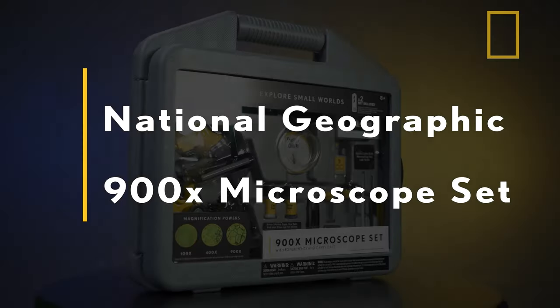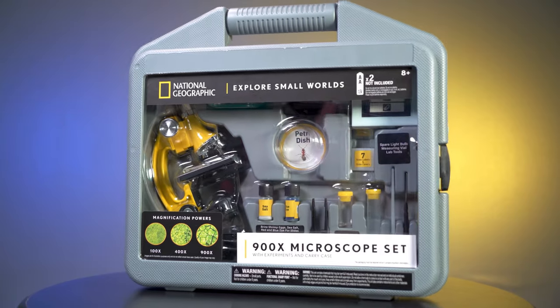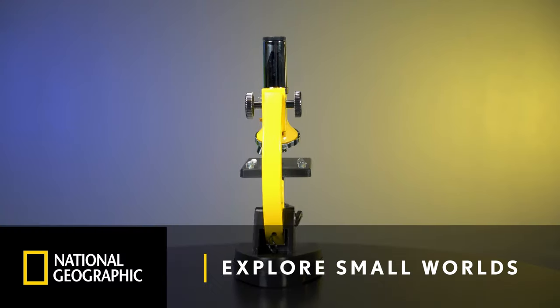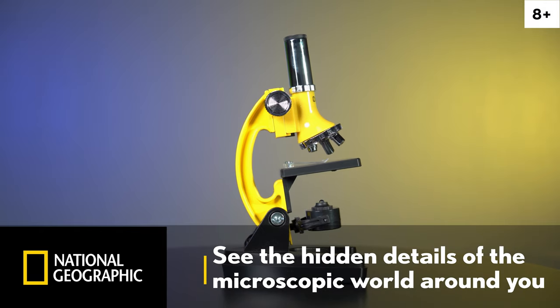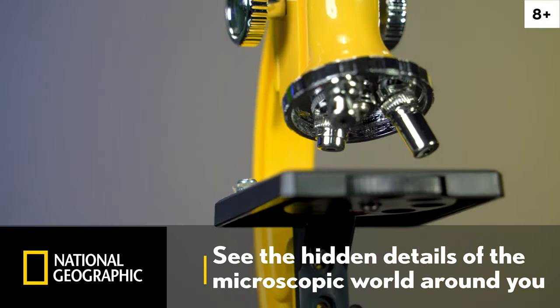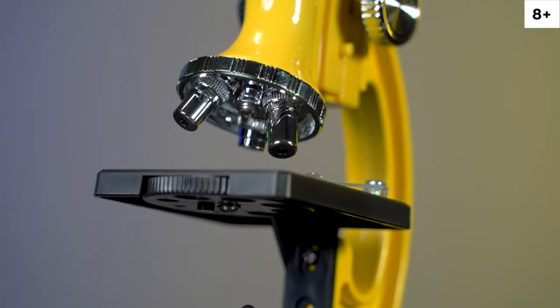Amazing discoveries await as you take your quest for the unknown to the cellular level with a National Geographic 900x microscope. Ignite curiosity into exploration of the world around you with this traditional compound microscope. Delve into the hidden details of unusual specimens or reveal the surprising dimensions of the world around you.